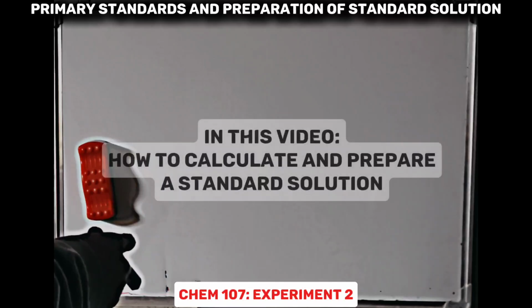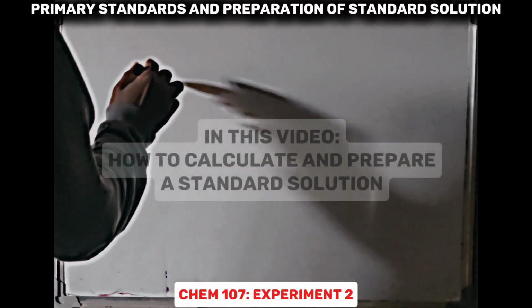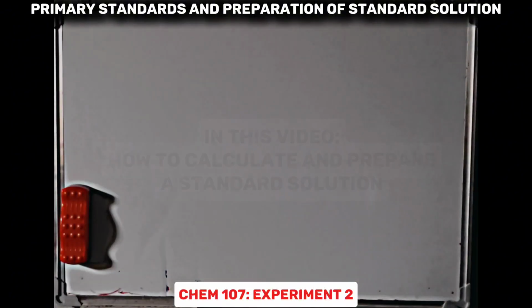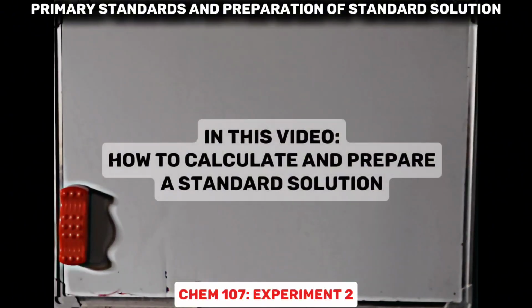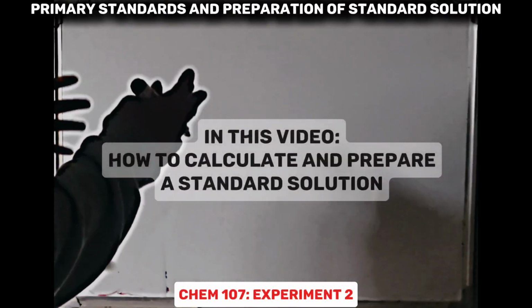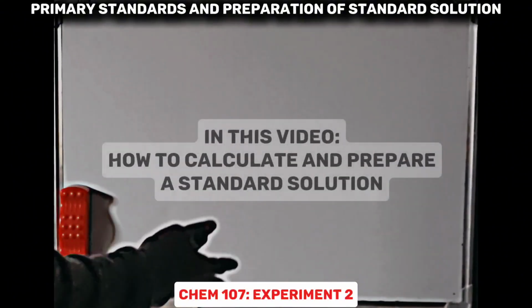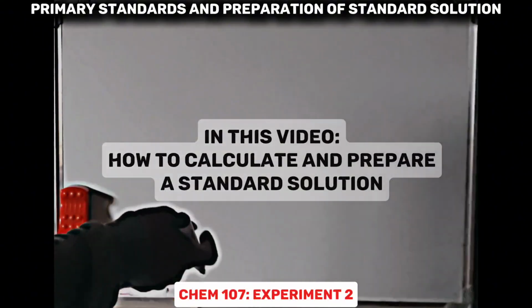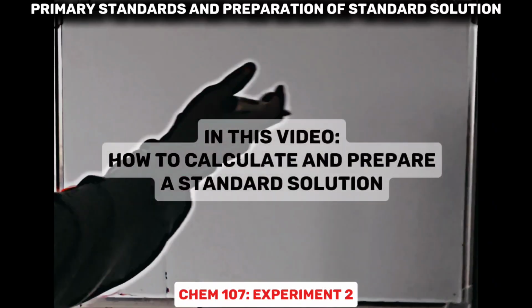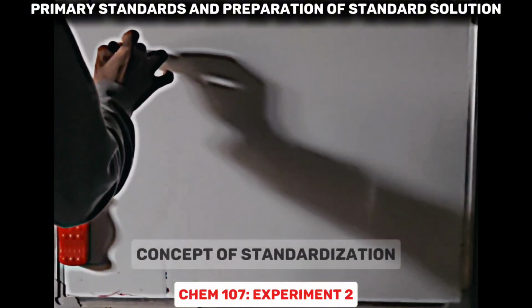So in this experiment, you'll be exposed to how to calculate the amount in grams and how to prepare a standard solution. The title of this experiment is Primary Standards and Preparation of Standard Solution. I'm going to illustrate how to prepare a standard solution, and how to calculate the amount in grams before you prepare the standard solution of a known concentration.